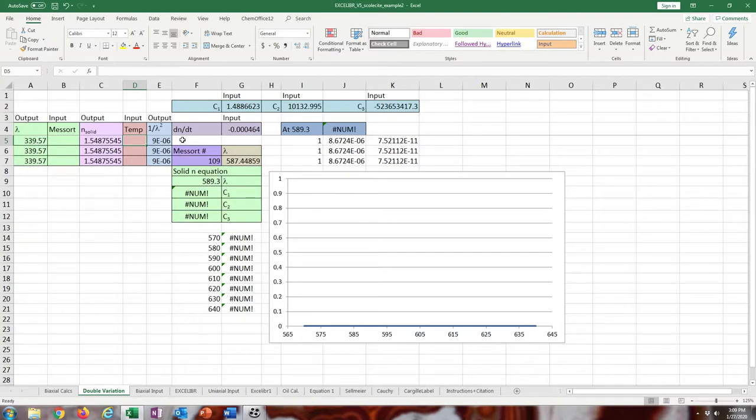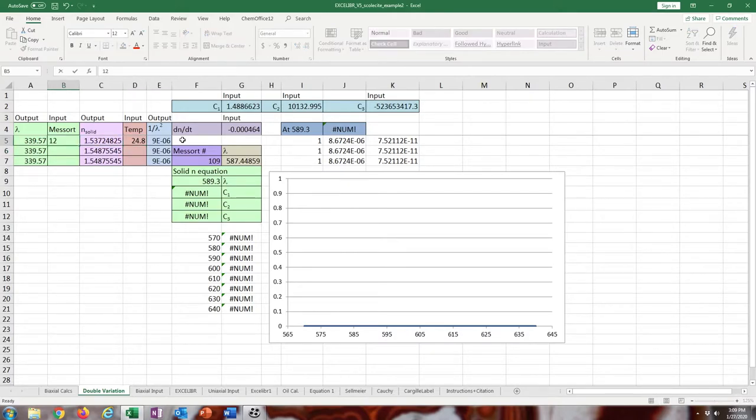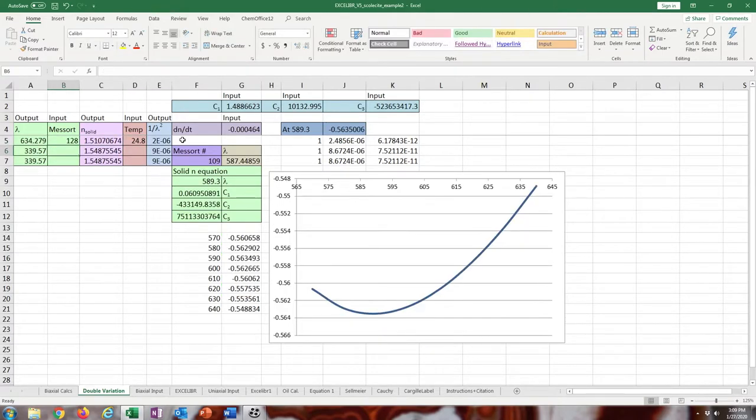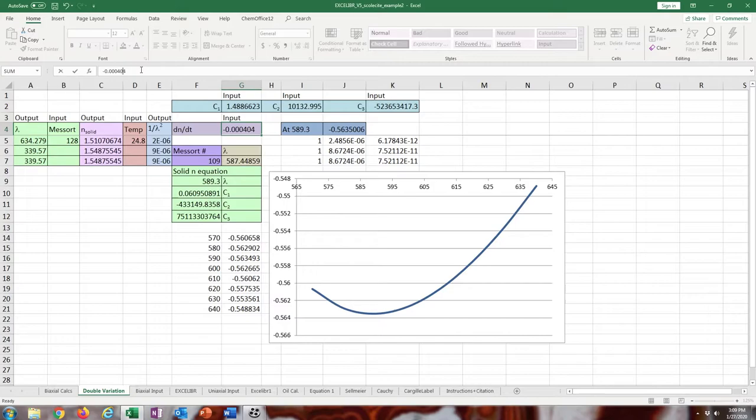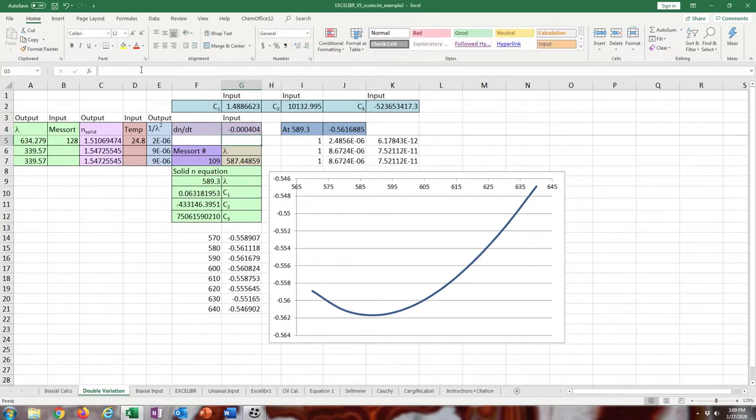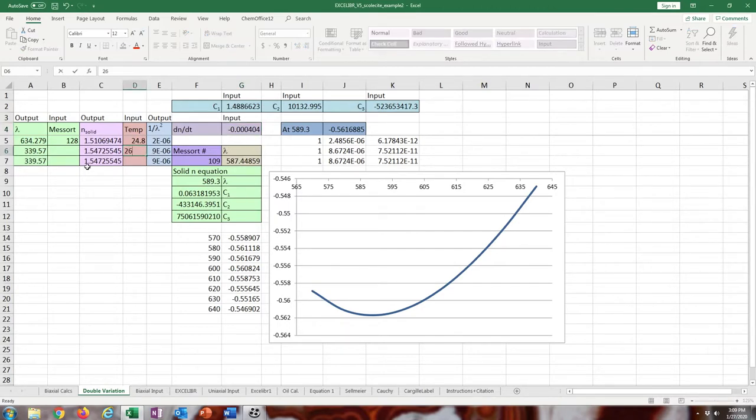We'll see what that looks like physically in a second. I'm just going to enter these in real quick. This is what it turned out to be, and I'll show you what it looks like under the microscope later. Make sure the dndt is correct.